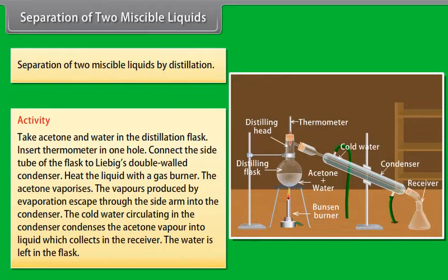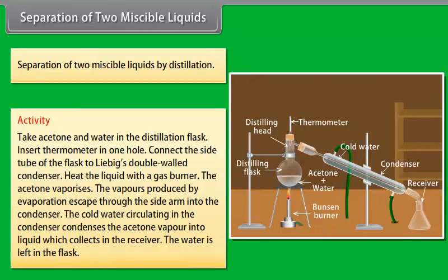Take acetone and water in the distillation flask. Insert a thermometer in one hole. Connect the side tube of the flask to a Liebig double-walled condenser.